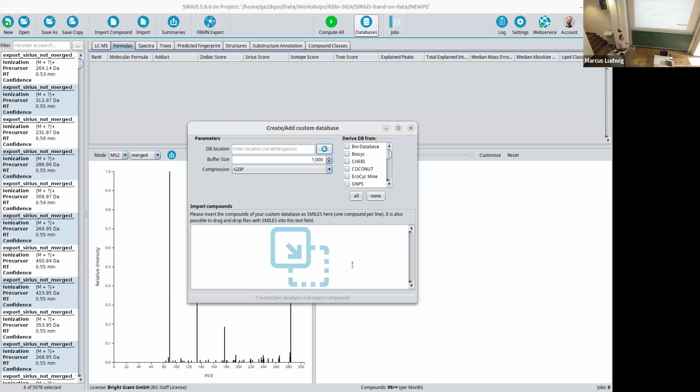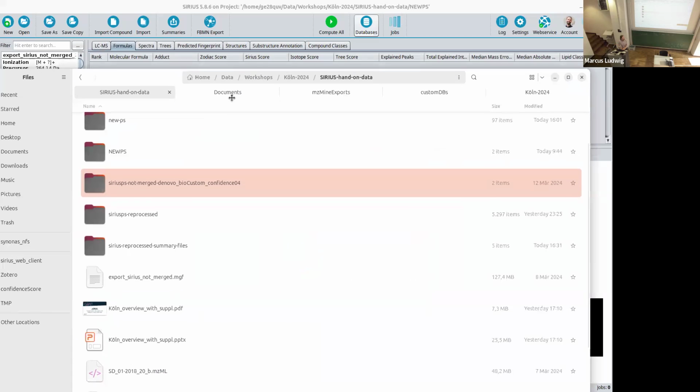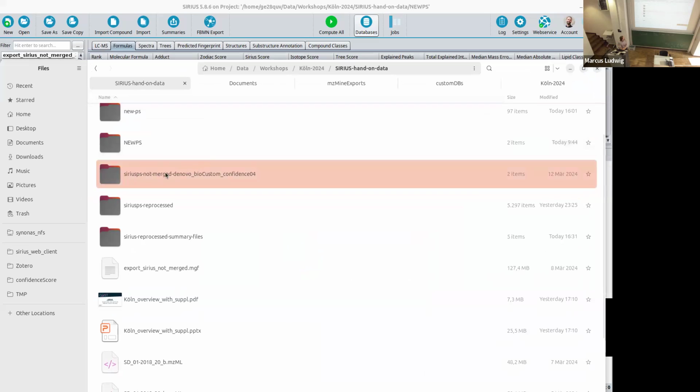But even if it didn't work, it's not so big of a problem because now we can just use the project space I provided. Because it takes some time to compute everything, I have a project space as a zip, which I provided to you in the drive, which is similarly named to this one, I assume.